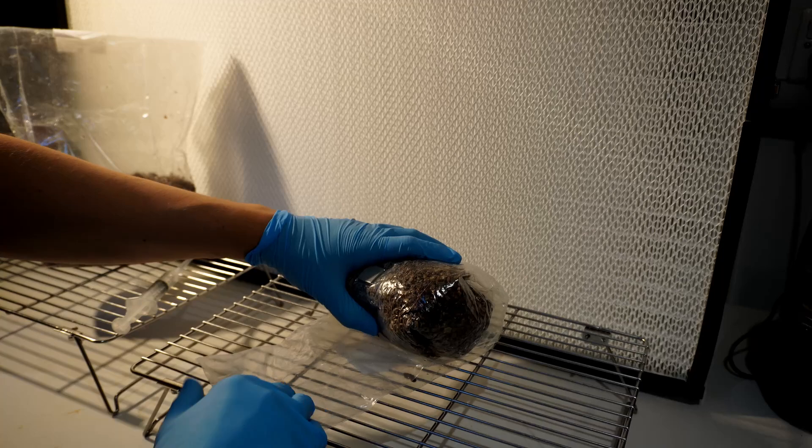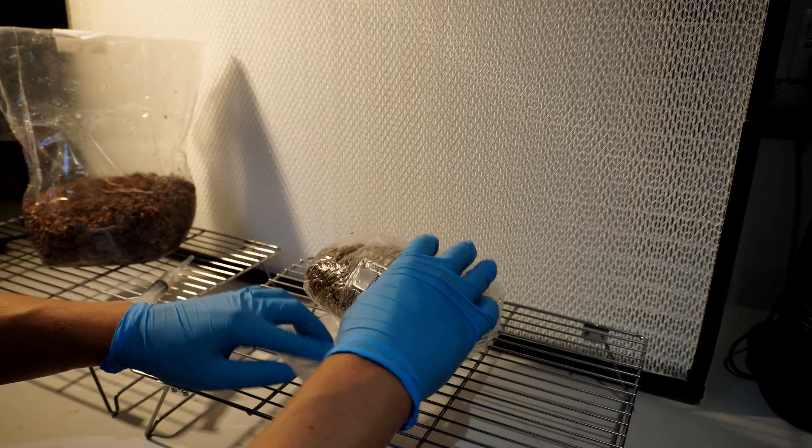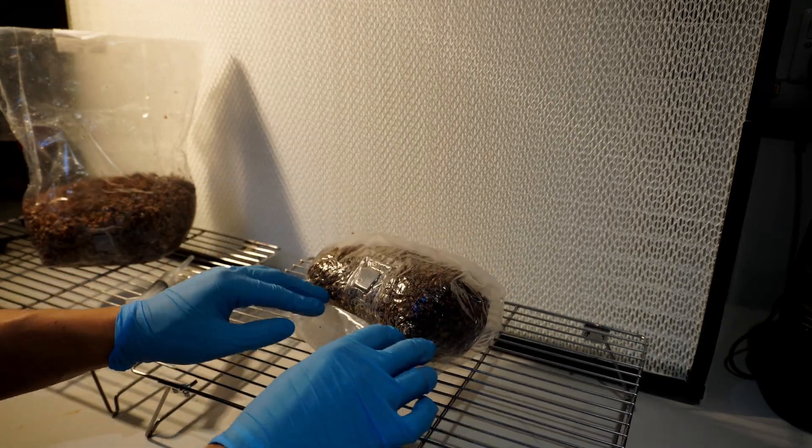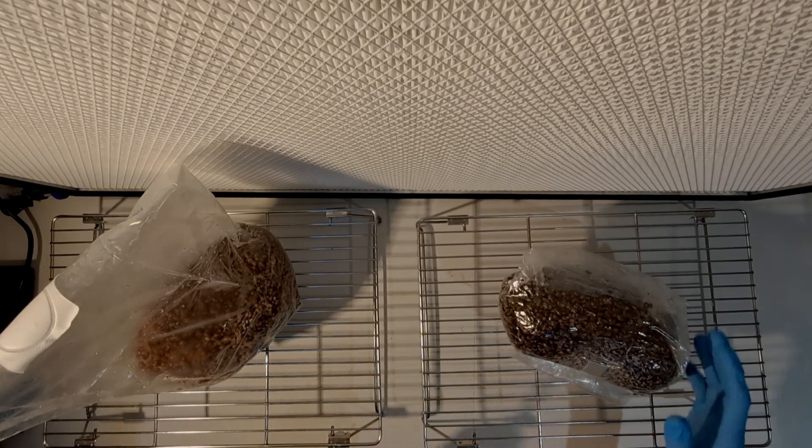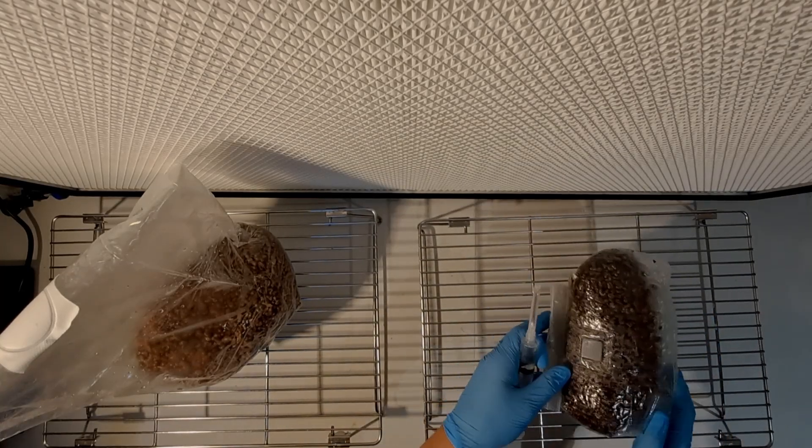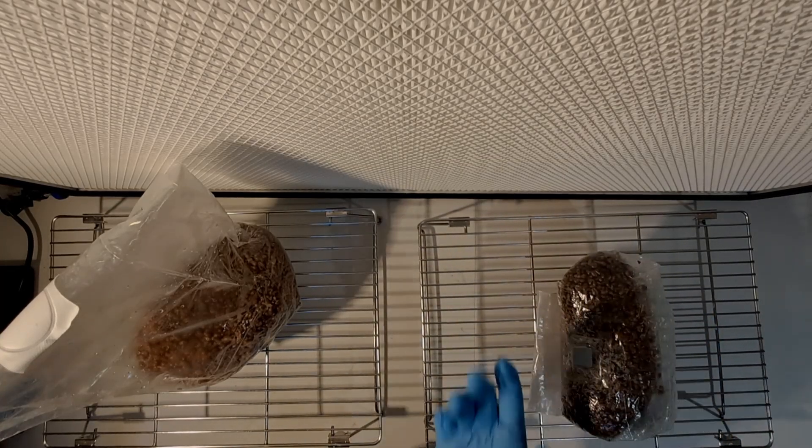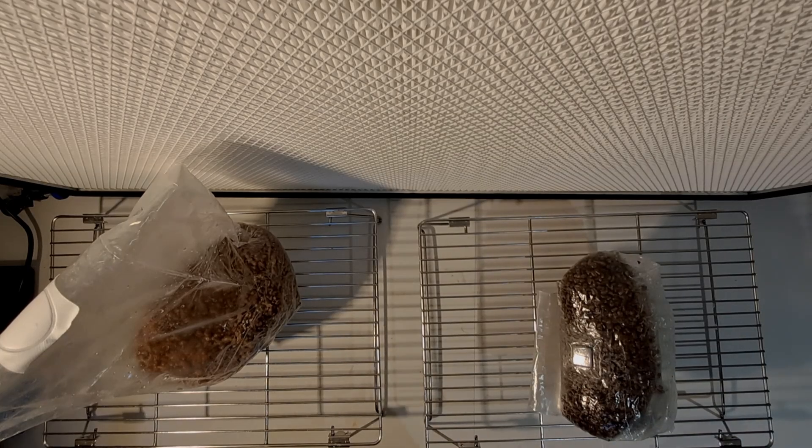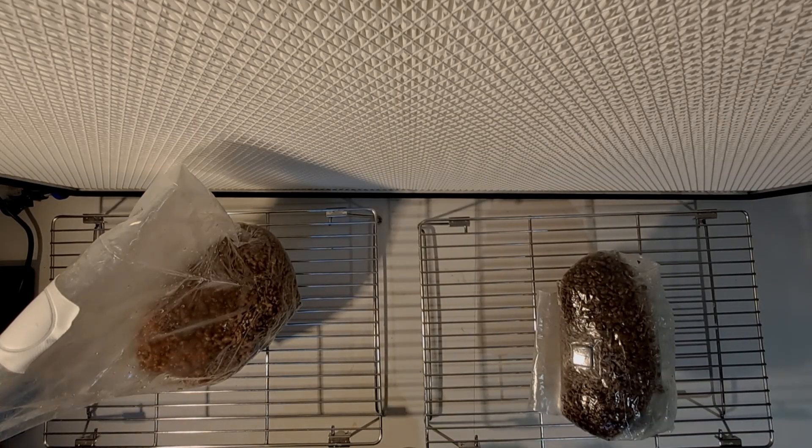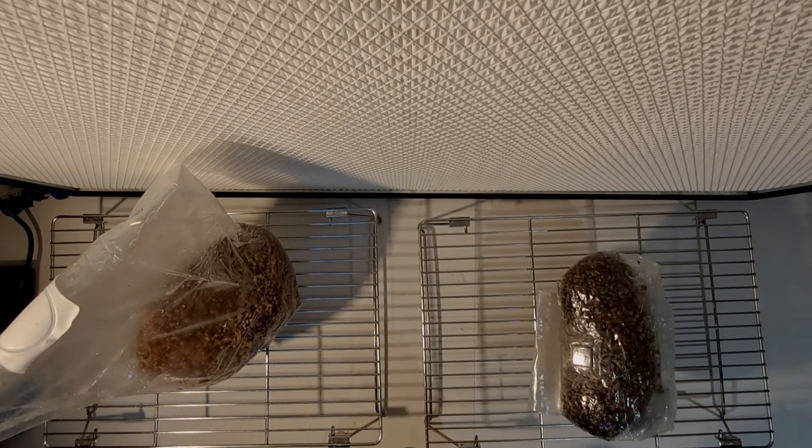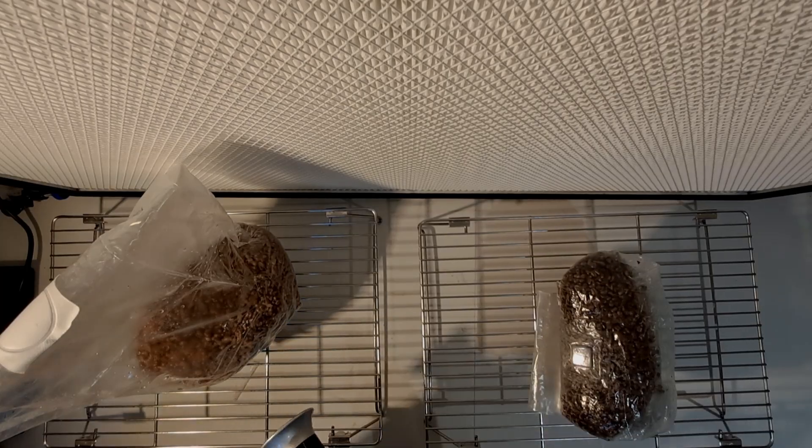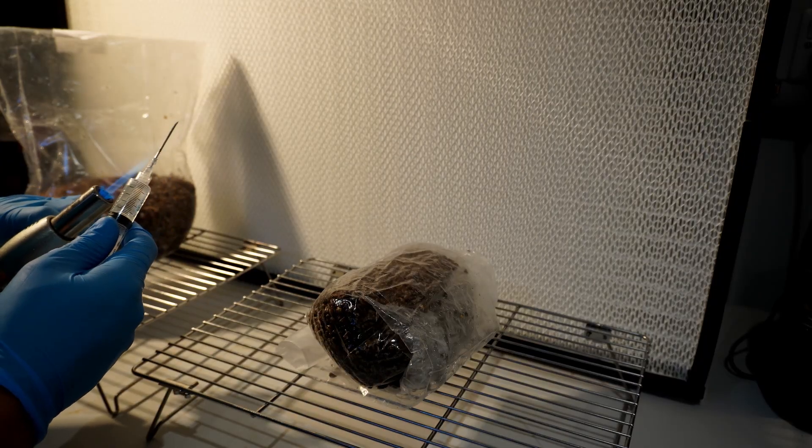We're going to create a little burrito here making as little surface area as possible, make sure the grains are nice and tight, and you can see just positioning the injection port into the airflow where it's not being obstructed. Flame sterilize the syringe and inject.